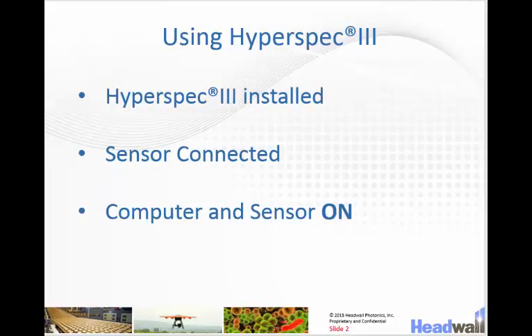Once it is installed, make sure that the sensor is connected to the computer you're using, and both the computer and sensor in that sequence are powered on.